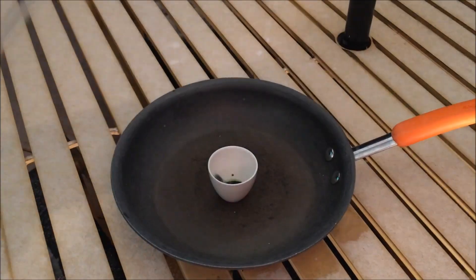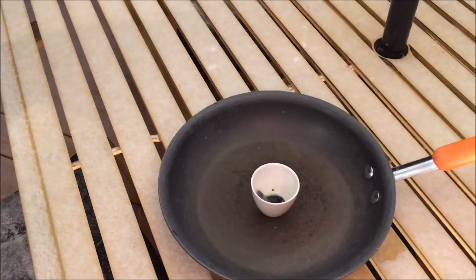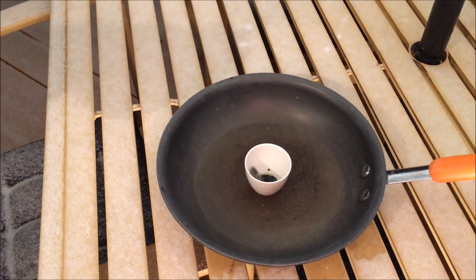I added a small amount of steel wool to this, but as you will see, nothing happened.